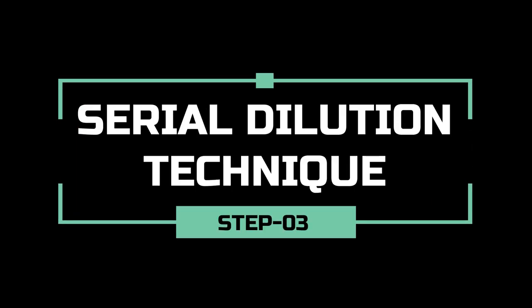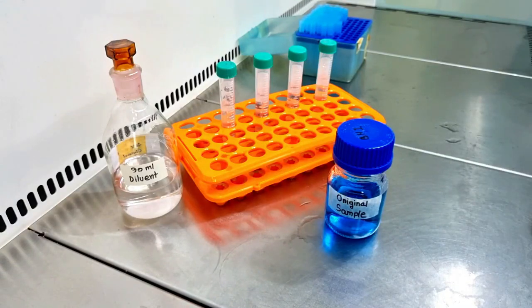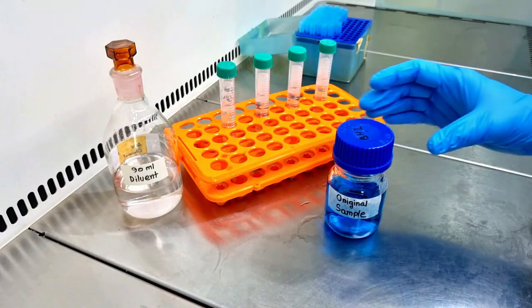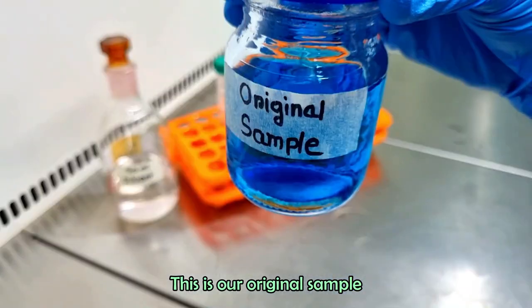In this technique, we will dilute our original sample into several times. We call the first one dilution 1. Second, third, fourth, and fifth are dilution 2, 3, 4, and dilution 5. You can dilute your sample to further numbers if you expect the analyte concentration in your sample is still high. This is our original sample.